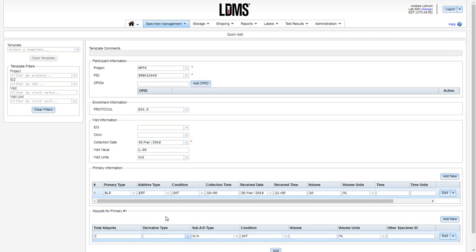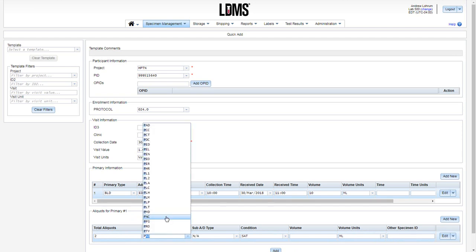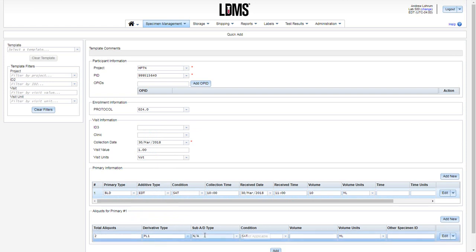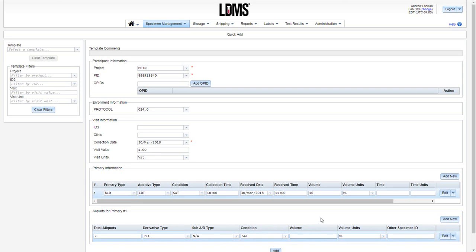Enter your derivative type. For this example, I will use PL1 for single spun plasma. We have our sub-add to derivative. Our condition code. And then the volume. And volume unit.